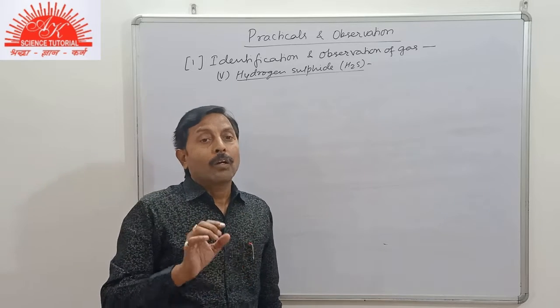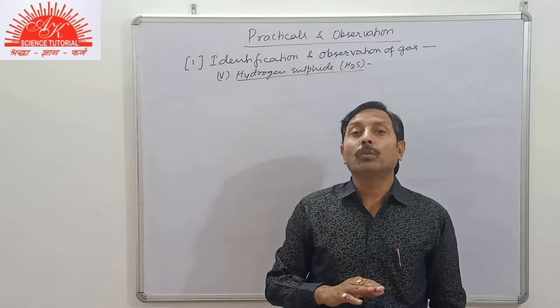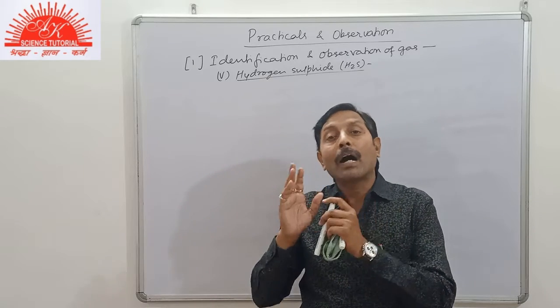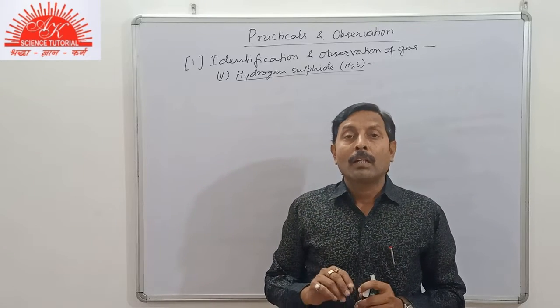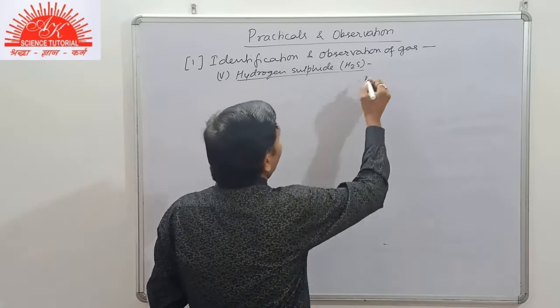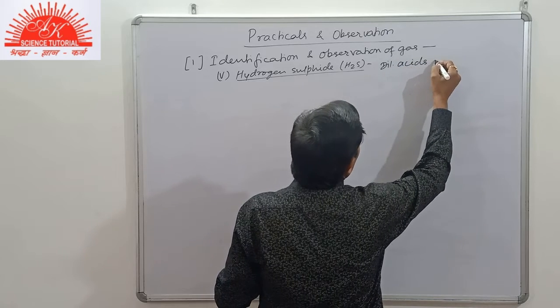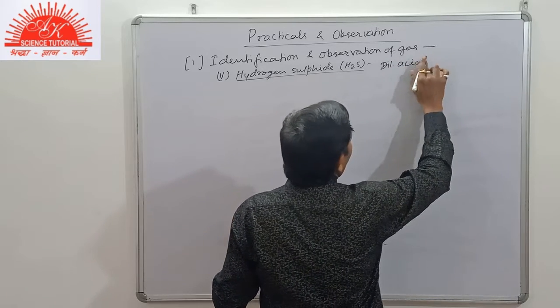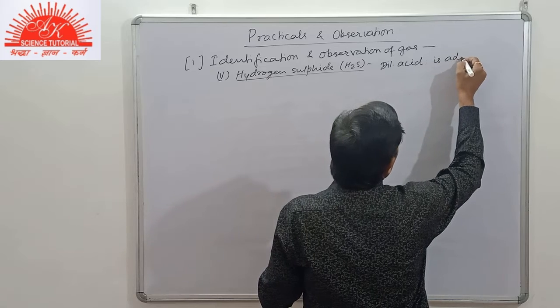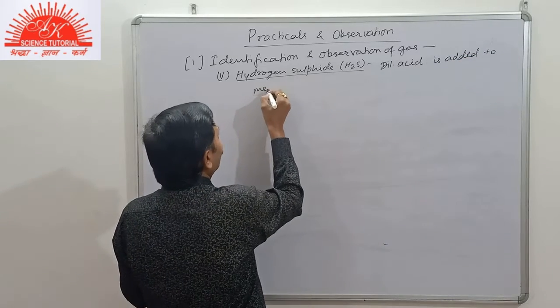In practicals, when dilute acid is added to the metal sulfide, then H2S gas is evolved.